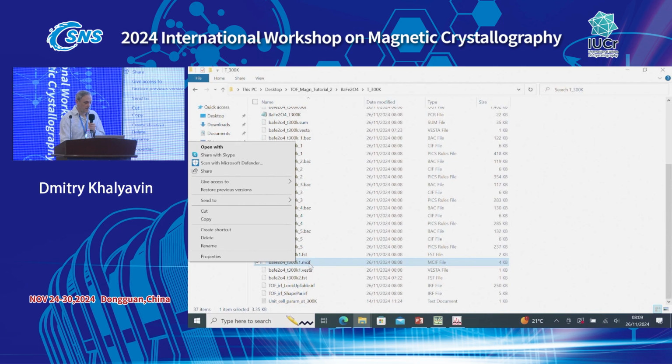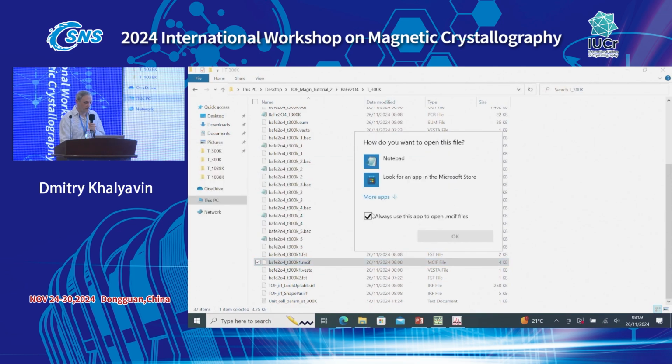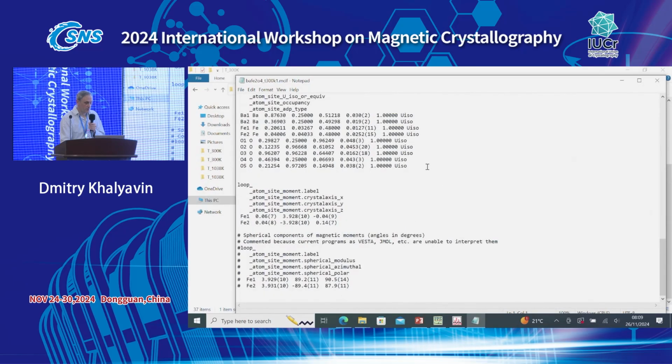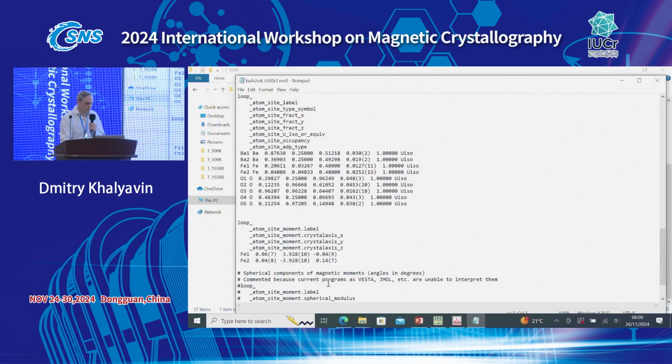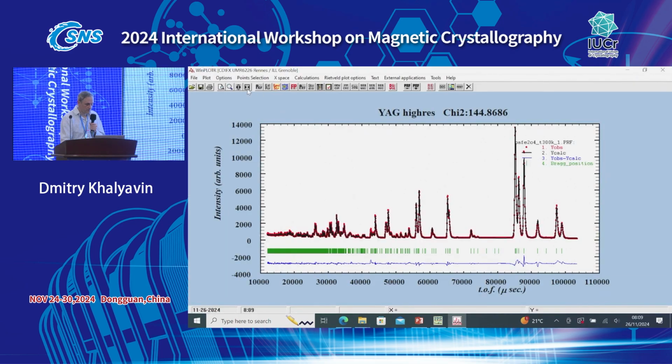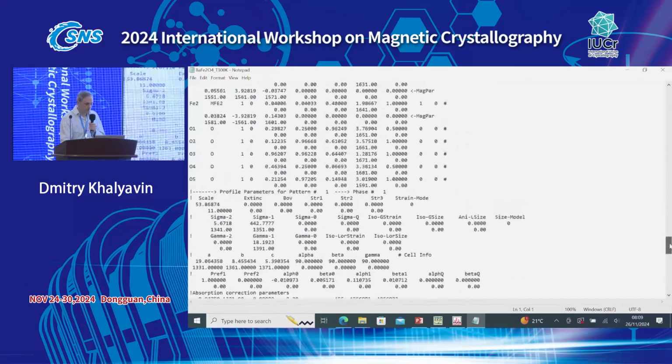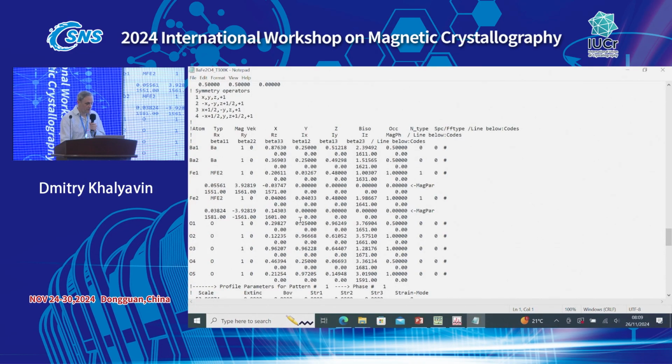So let's open this file and see what... so no, it doesn't look right to me, no? Is it correct? Let me see. No, it is correct. Yeah, so it's correct.